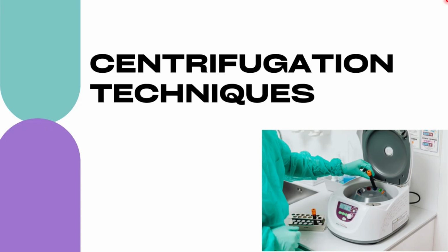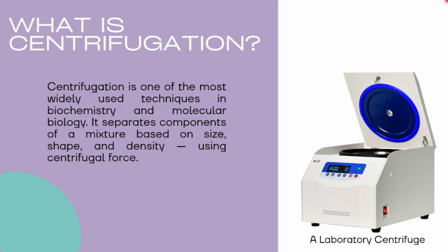Today we are going to be talking about centrifugation techniques. Now, centrifugation is one of the most widely used techniques in all of biochemistry and molecular biology. And what it does is that it simply separates components of a mixture based on size and density using centrifugal force.